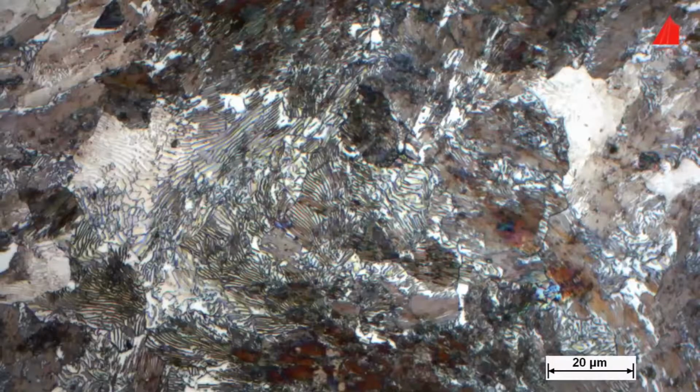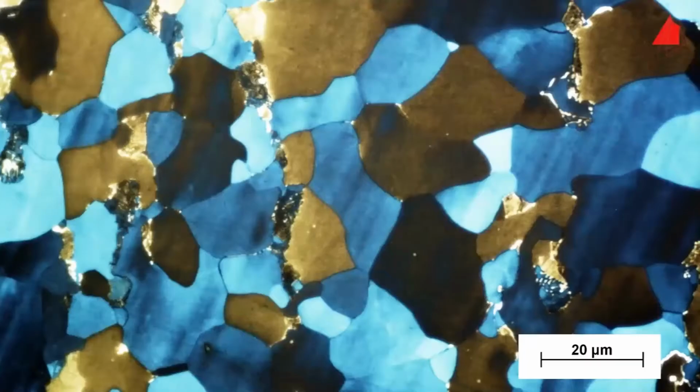This is the plain carbon steel C80 with 0.8% of carbon. Only pearlitic regions with their characteristic alternating layers of ferrite and cementite can be seen. And this is the plain carbon steel S235 after a color etching. It only has a low carbon content. The relative amount of differently colored ferrite crystals is high, the proportion of pearlite regions low.